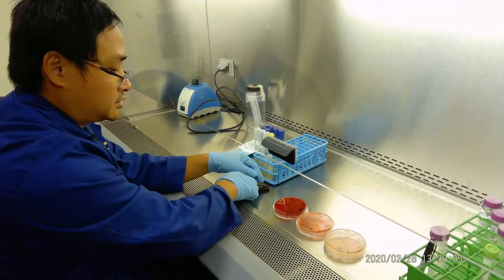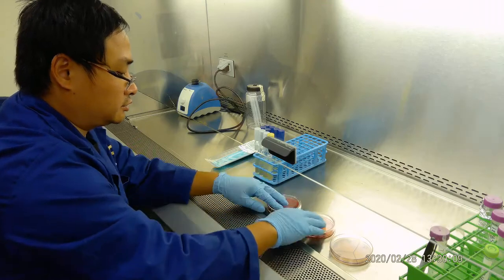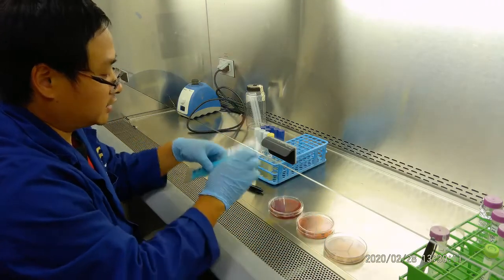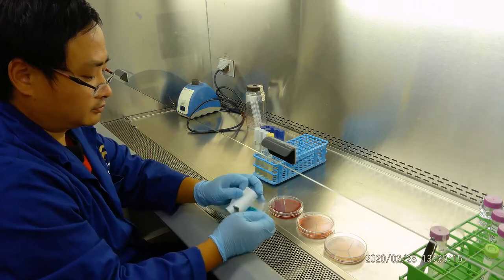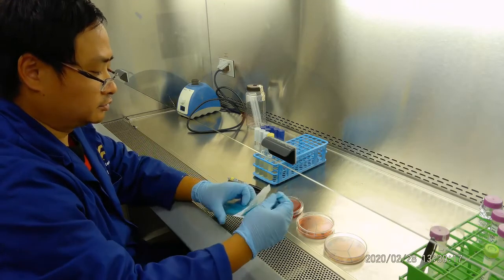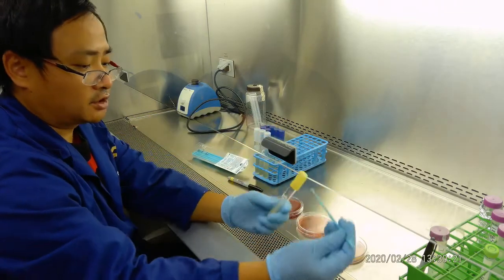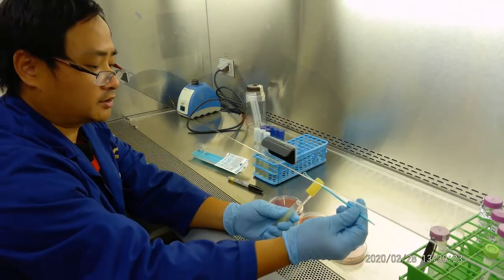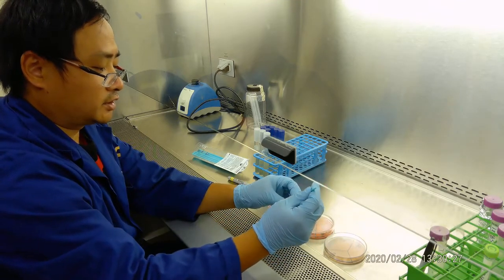After we're done with this, we will do the inoculation. Now the inoculation, you can do them together. So we have a loop. We're going to take out the loop. Get one loop. Okay, so we have E. coli. We have Staphylococcus aureus first. Take a picture, Lee. So we take it out, and we're going to get it from here.